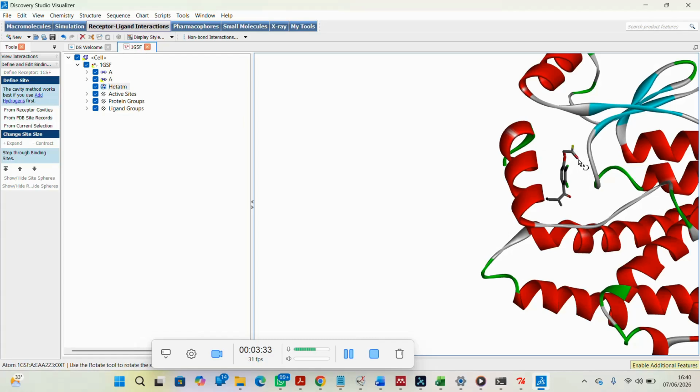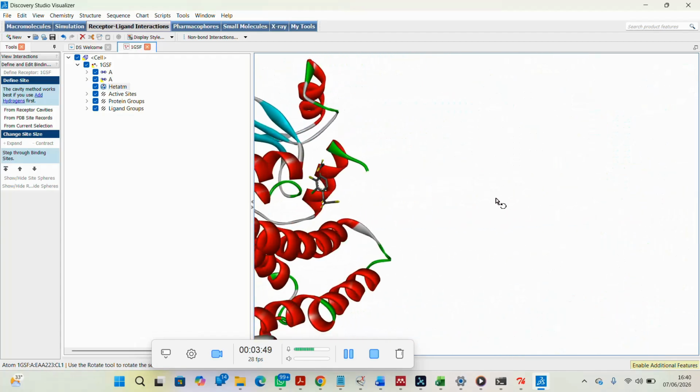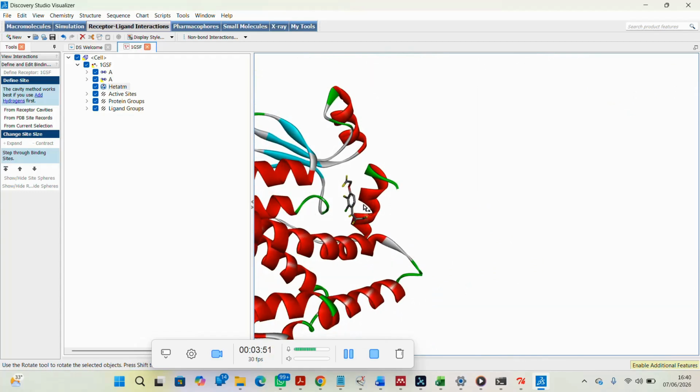Then hold your shift button, click this other edge, then just pick all the edges out so that you can capture around. Yeah, feel free to flip the whole structure around so you can capture some more edges. Hold your shift again and continue. You can see that all the edges I am clicking, they are turning yellow. That is, they are being highlighted.